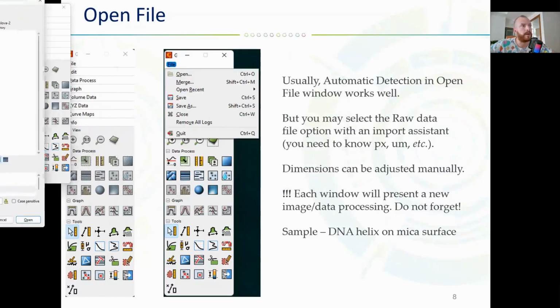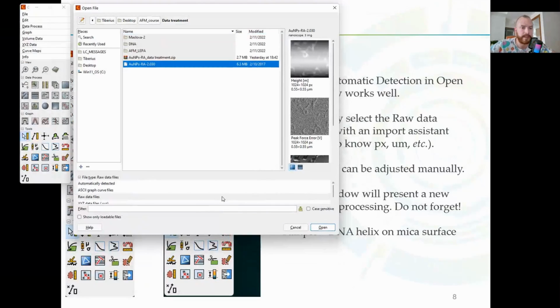For example, with this raw file import or ASCII file import, we imported custom-created Raman maps, and then we can play with these maps. We can analyze, for example, the distribution of the signal, the roughness of this distribution, and so on. So it's really a good tool if you understand how it works, and if you play at home with all this data by yourself, it would be great.